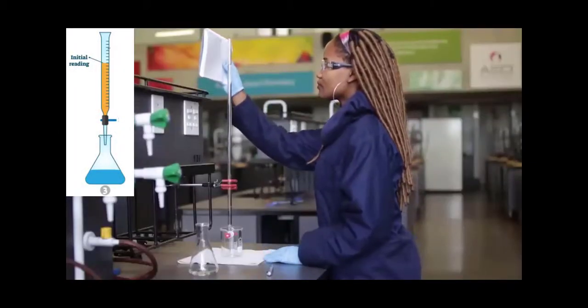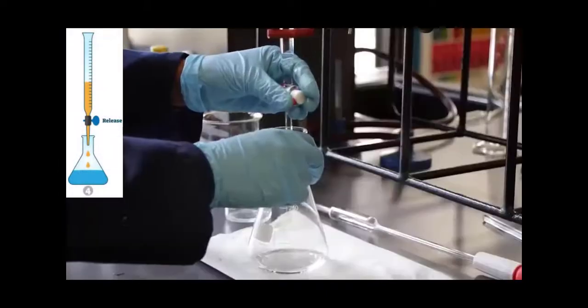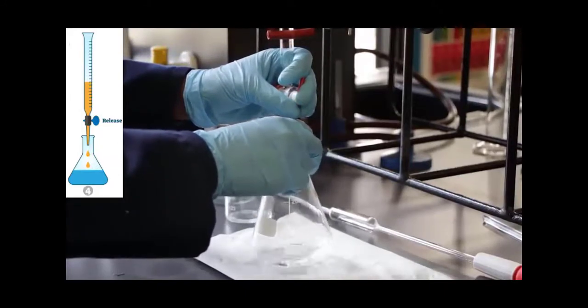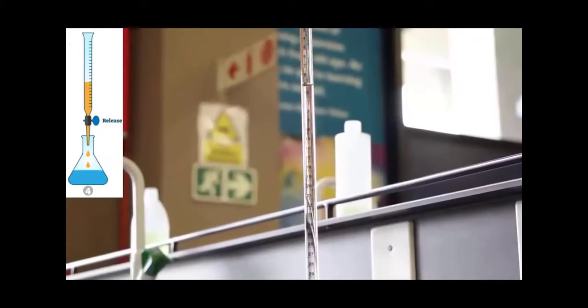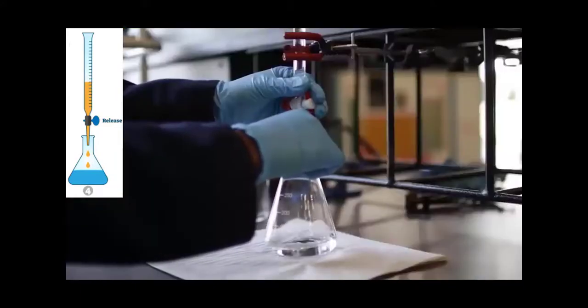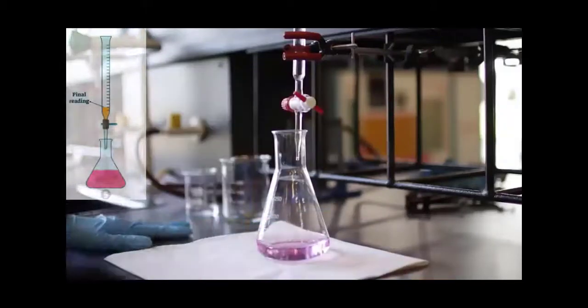We'll get the initial reading here very accurately. Then we'll add the titrant. We gradually add and gradually add until finally we get to the point where we know all of the acid has been reacted because of the change in color by the indicator, this pretty pink that you get with phenolphthalein. Record the data, and then we can do our calculation.